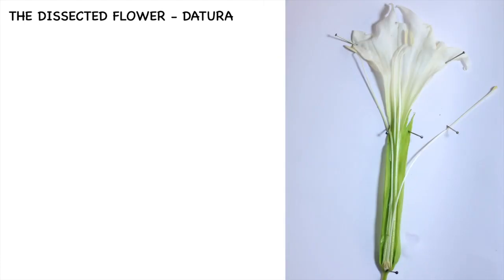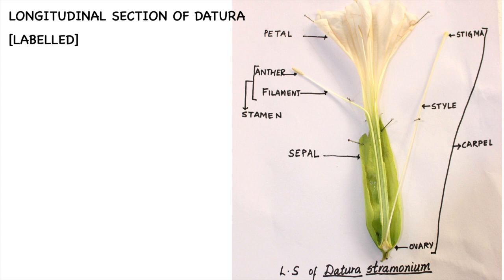Here we have the dissected Datura Stramonium flower, that is the longitudinal section (LS) of the flower, which is pinned up. After pinning up as shown here, we have to now label the parts. Here is the complete labeled LS of Datura Stramonium.